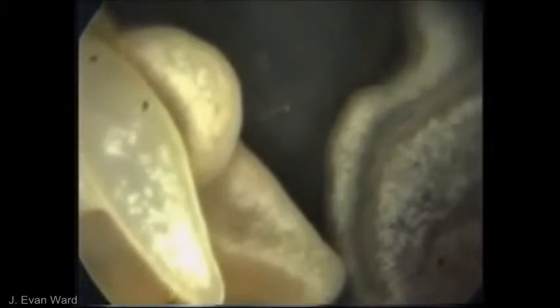We will now make more detailed observations of the gill by means of video endoscopy. Moving past the head, we zoom in on the proximal edge of the gill, which you can see at the right of this video clip. The individual filaments of the gill, which are approximately 73 micrometers in width, are now visible. Watch carefully as particle masses, including added red particles, are captured on the frontal surface of the gill filaments and move distally by the frontal cilia.